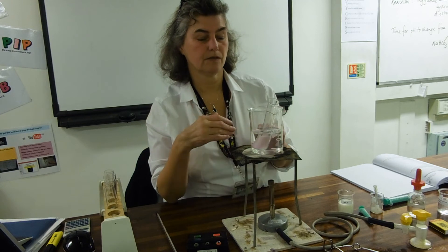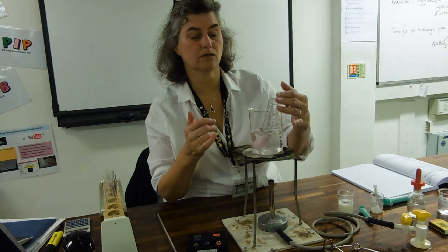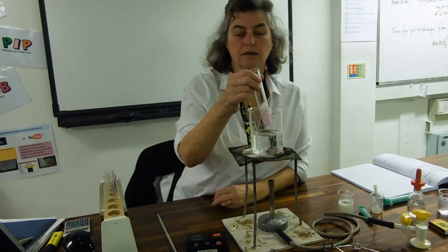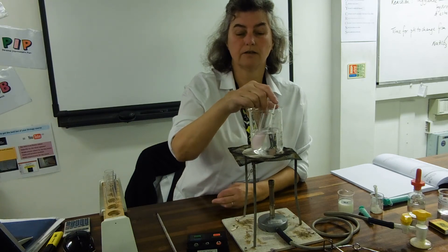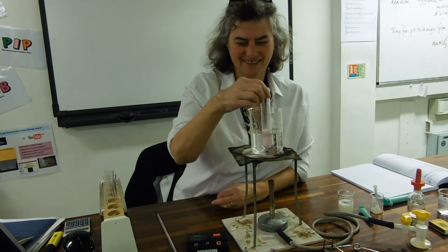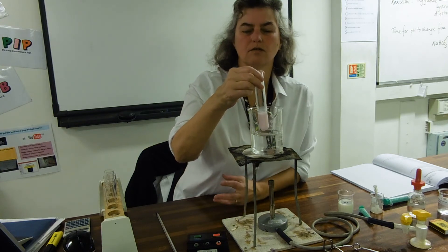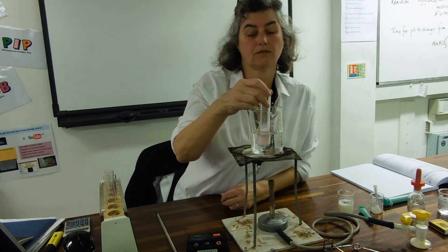If I was going to do the whole experiment, I would warm up my water to 35 degrees, keep it at 35 degrees, do the same again — wait till both have got to 35, pour one into the other, and time. What we're expecting to happen is that the time will get faster and faster until the temperature goes high enough to denature. This group have just done it and their enzyme is starting to denature somewhere between 55 degrees — some people got very long times at 65 degrees.